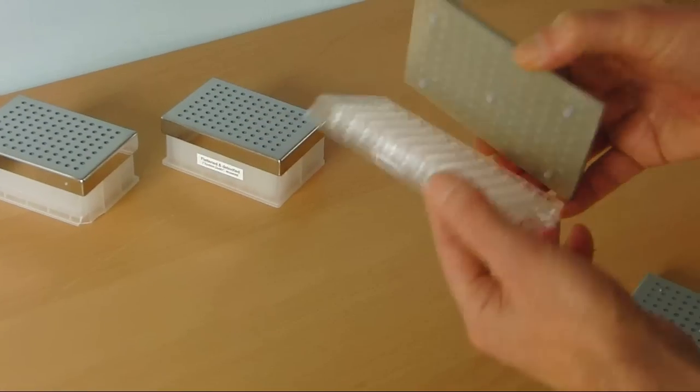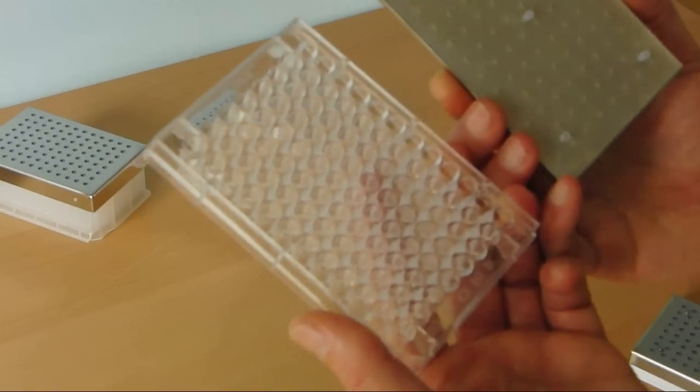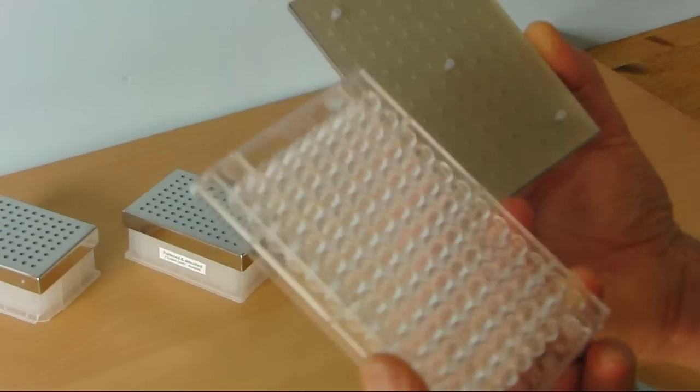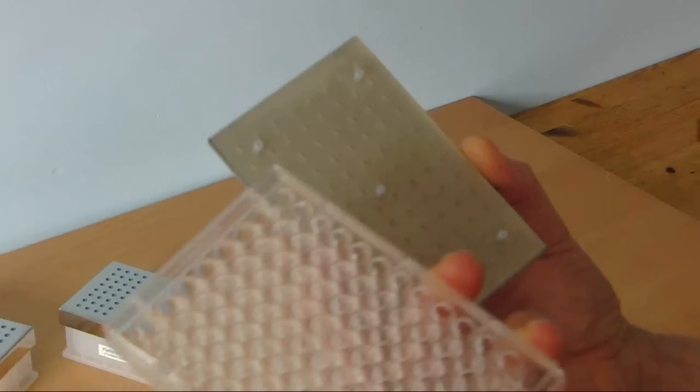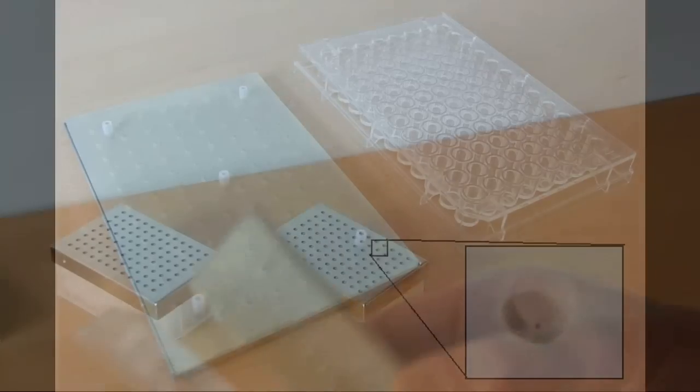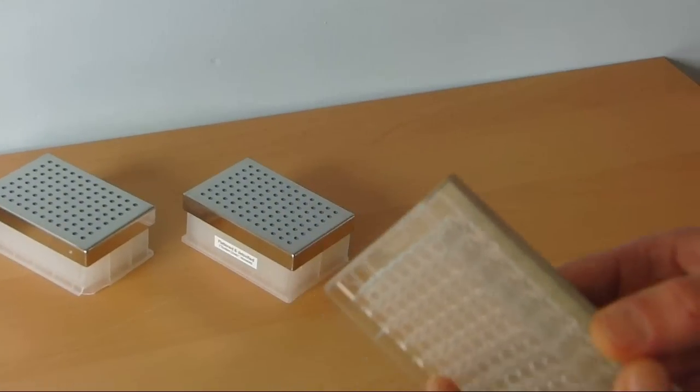For polystyrene round well plates, we have this type of sandwich cover. It has five positioning pins that fit in the spaces between the round wells. This type of cover also has a stainless steel foil with tiny holes in order to further limit the exchange of headspace air and so also further limits the evaporation.